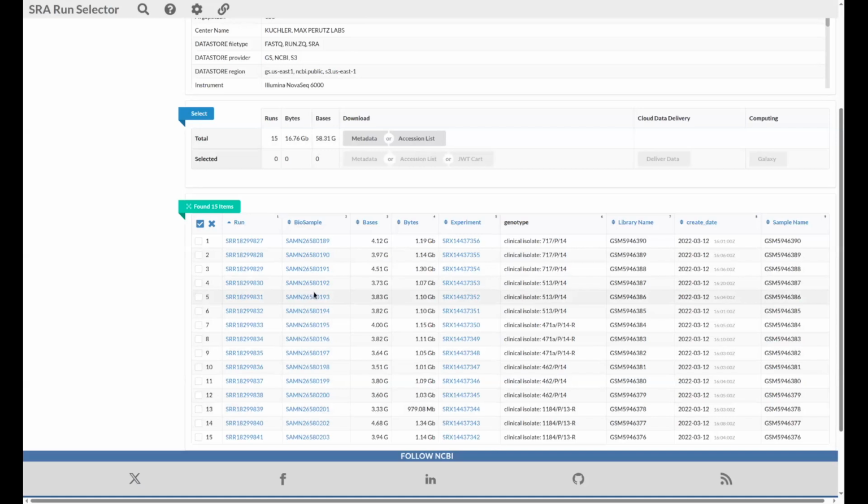You can actually see, I'm not going to move this data, of course. I'm just going to show you how this works. It's a sizable data set, 15 samples. It's a nice data set because for each isolate, it contains replicates, so you actually have 3 replicates per data point.